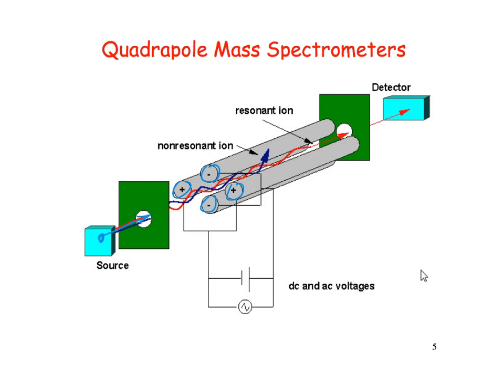Okay, so these are usually much smaller instruments than those big ones, less expensive, oftentimes hooked up to a gas chromatograph or something like that. But these are usually the lower resolution types of instruments. So this is the ion source here.